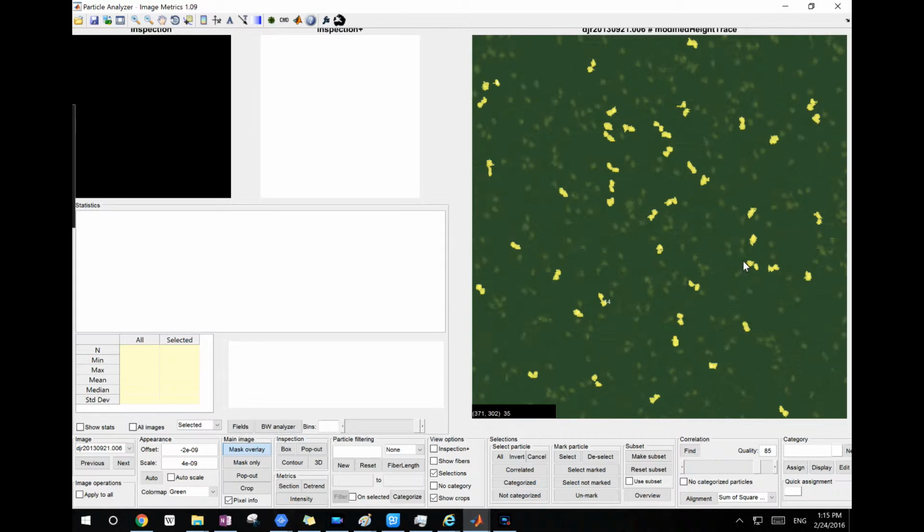I mean, you can still find them, but the alignment won't be satisfactory, because if they don't have any orientation, you can simply align them in any orientation. So it's easier to realign these particles if they already have some kind of directionality, like the one I chose here.